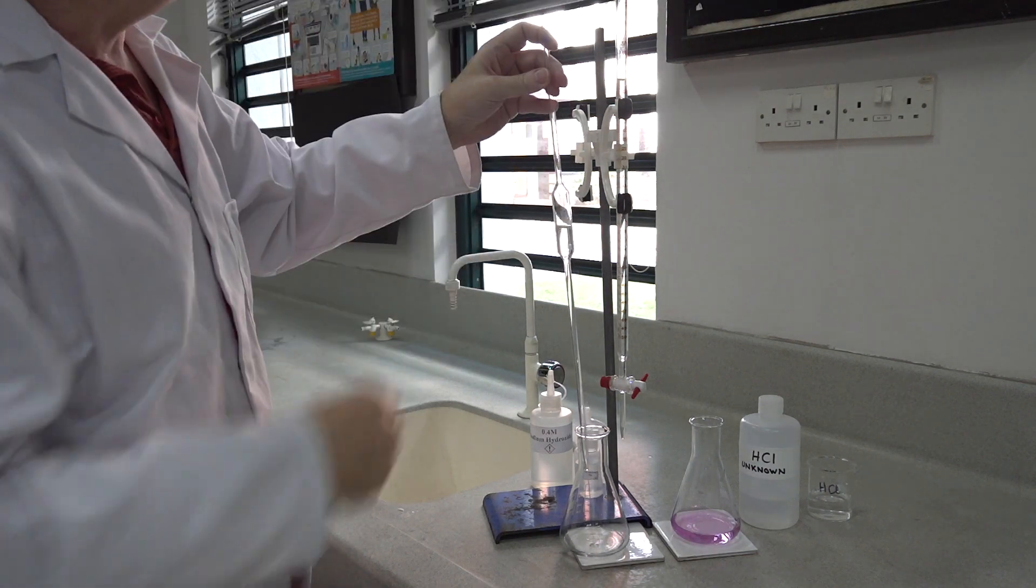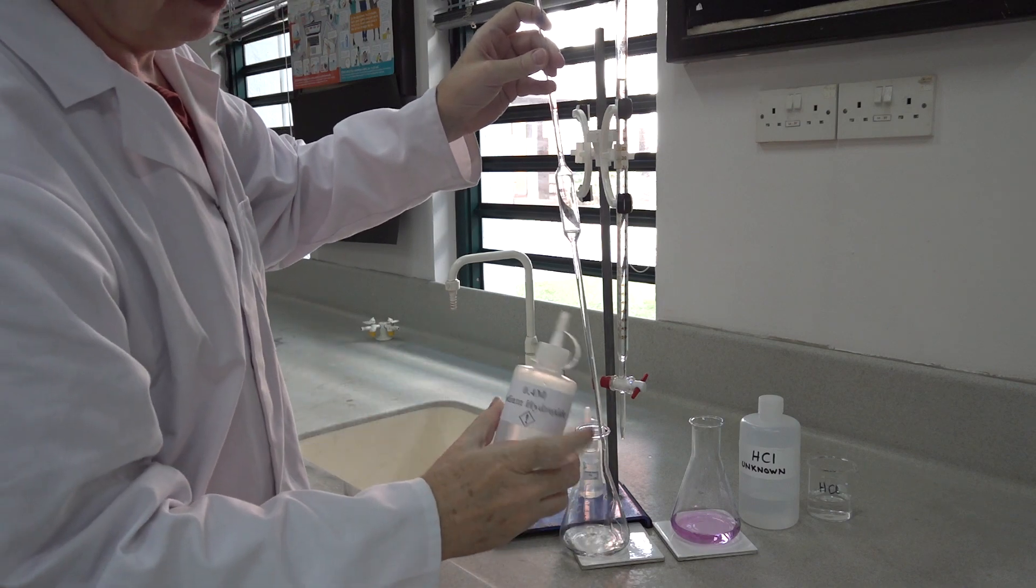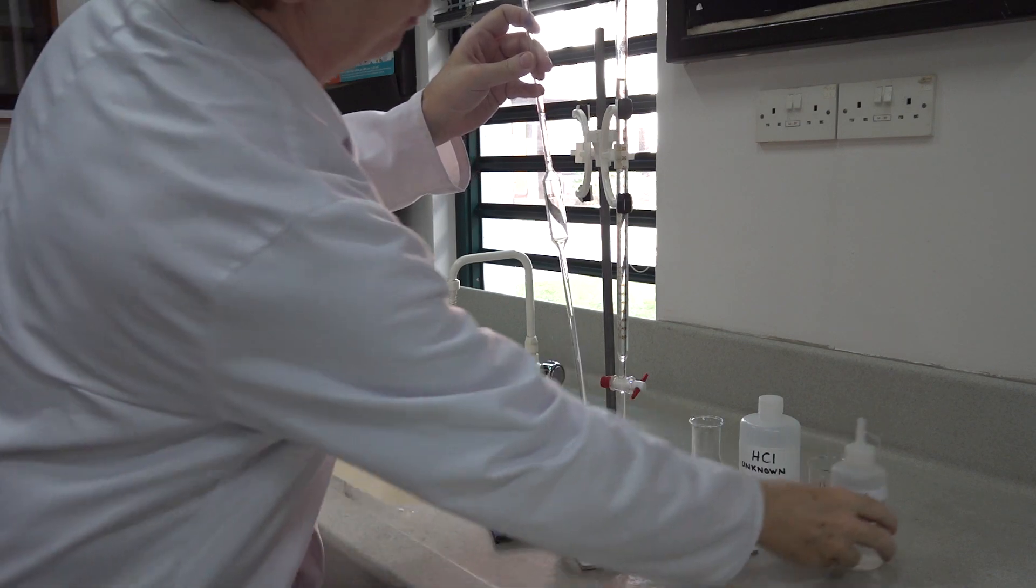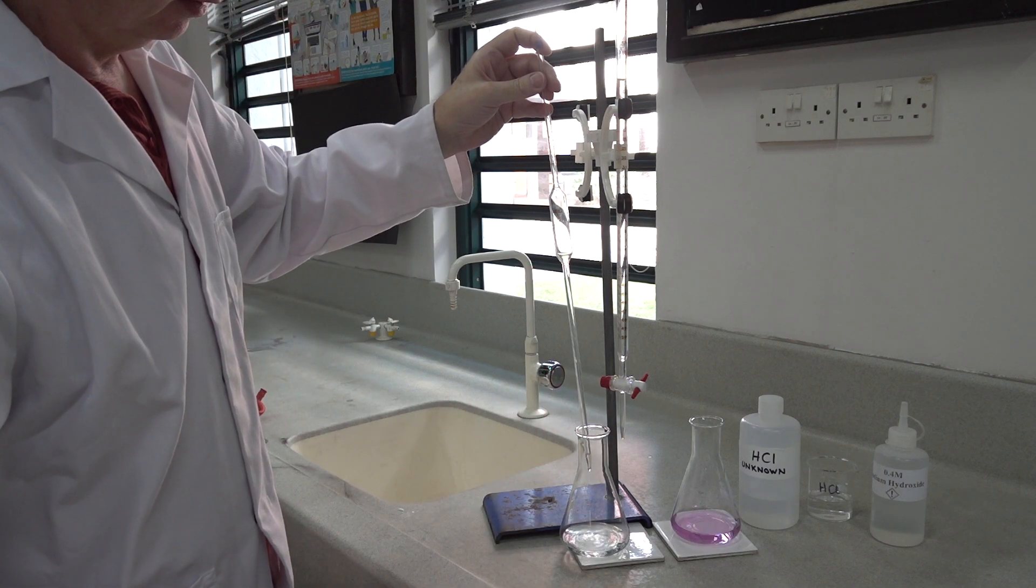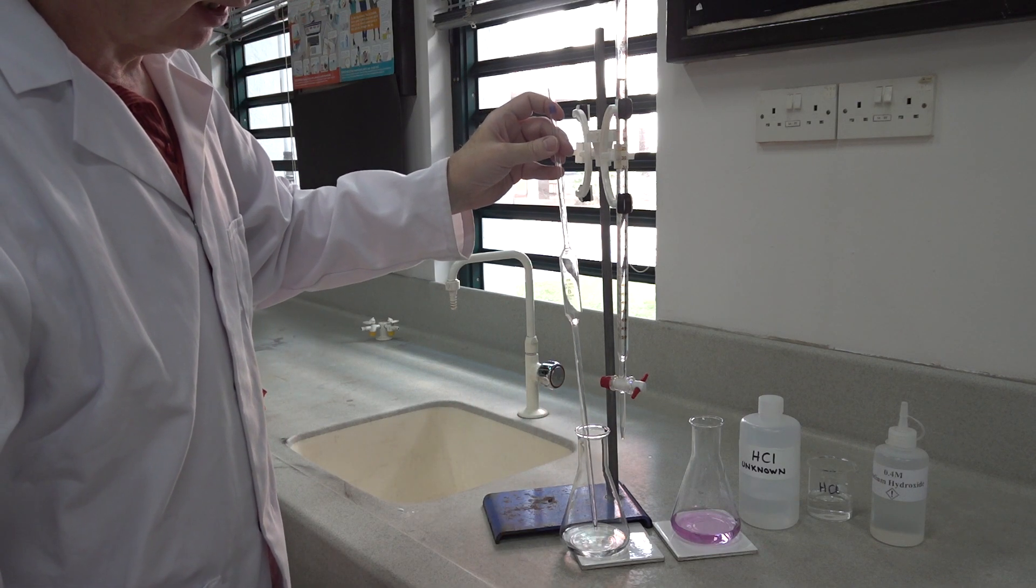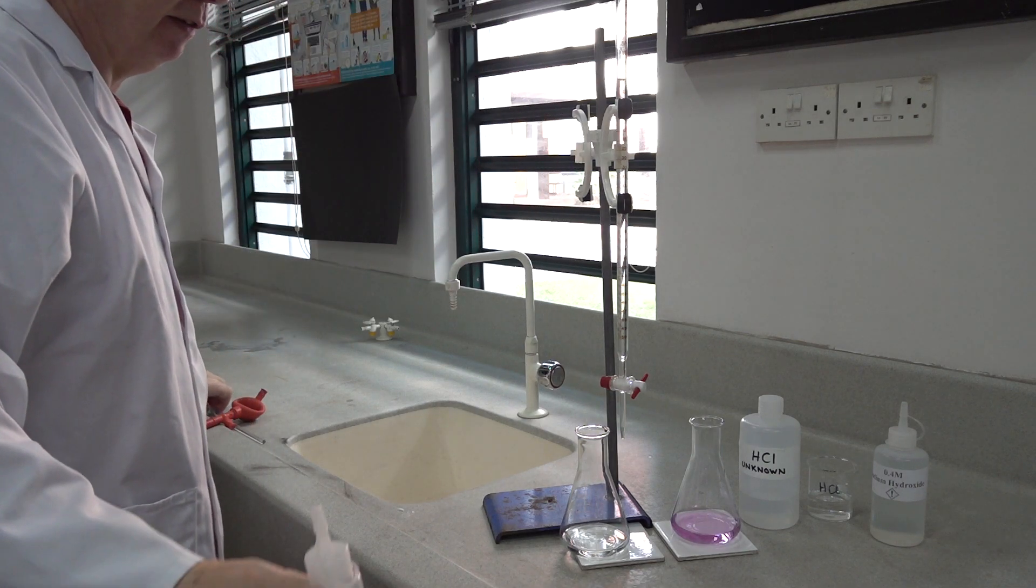In the burette, we've got sodium hydroxide of 0.4 molar concentration. We just need to tap the bottom of the pipette into the solution. That gives us 25 centimeters cubed.